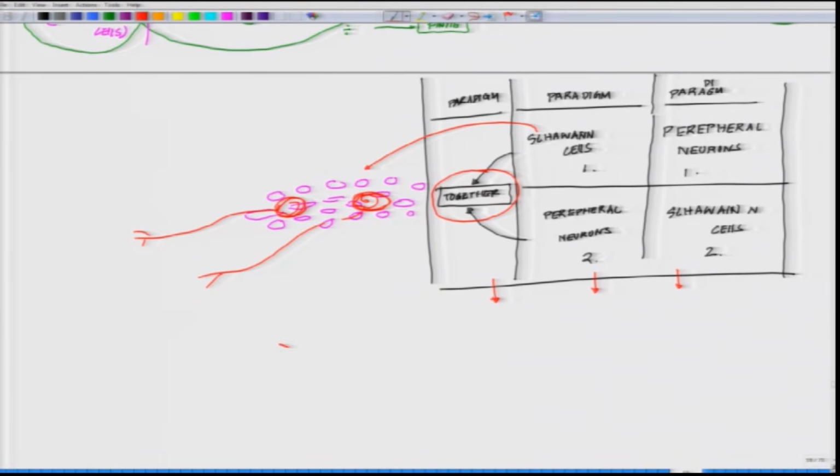Now if you look at the neurons when they are forming a myelination, this is the classic part, what you will be observing. These are the dendrites, and assume that this is where you are seeing the myelination. Right.